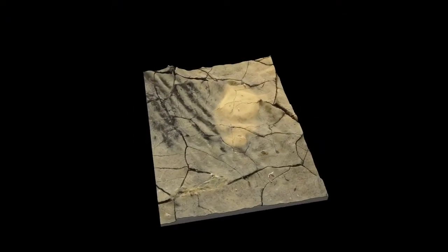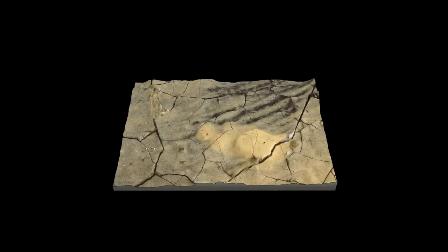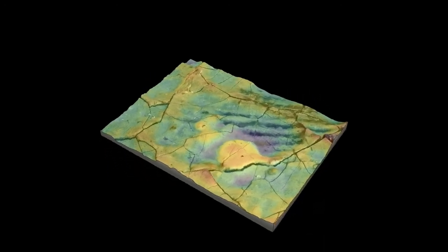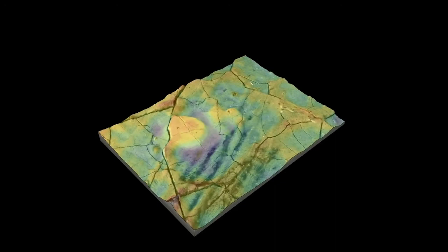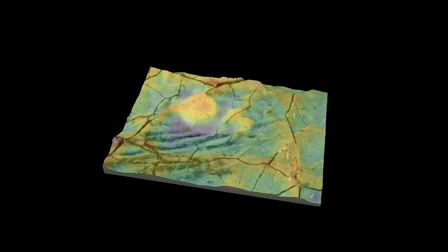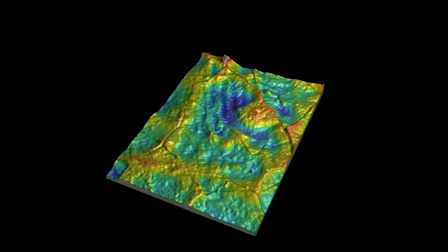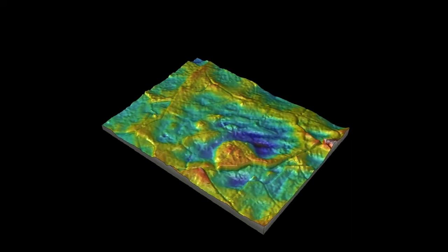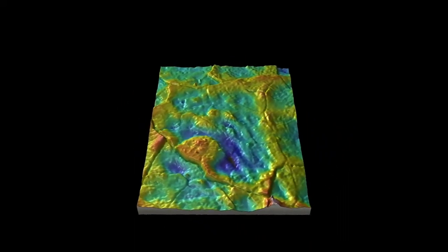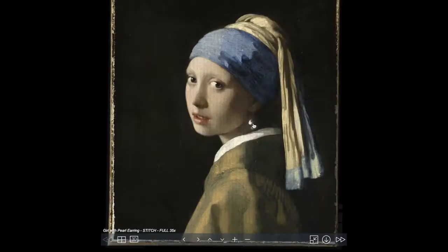This is the result of this scan, a 3D image of the surface where we can observe with high precision the topography and measure the height of those two dots. Here the color represents the altitude. Red is the highest and blue is the lowest point of this 3D. You can also see cracks, dust and pigments. The total height is 130 micron, which is 1/7 of a millimeter.